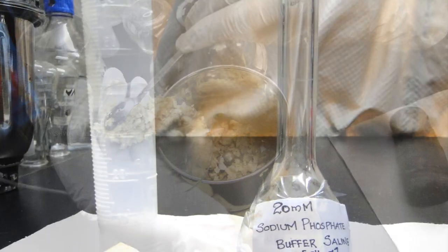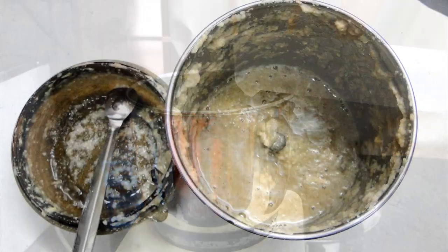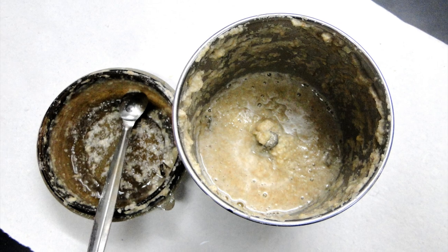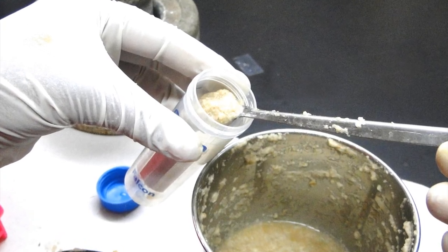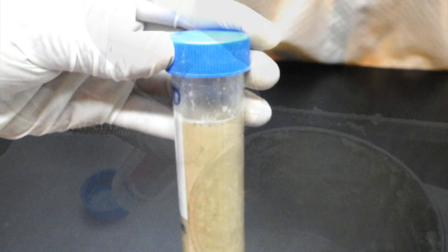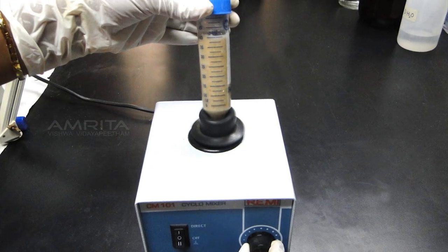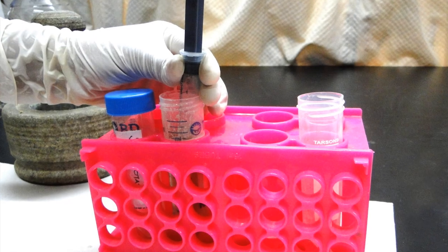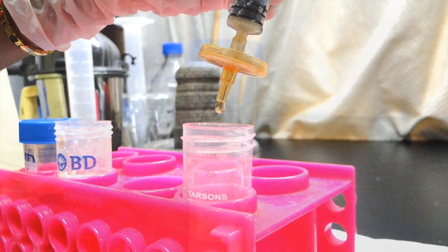Add 40 ml of cold 20 mM sodium phosphate buffer and blend until it forms a paste. Gently transfer the potato slurry into a blue capped tube. Allow the enzyme to extract over a period of 1 hour at room temperature with frequent vigorous stirring using a vortex mixer. The extract is then filtered using a GFA glass fiber filter and the filtrate is collected in a new blue capped tube.